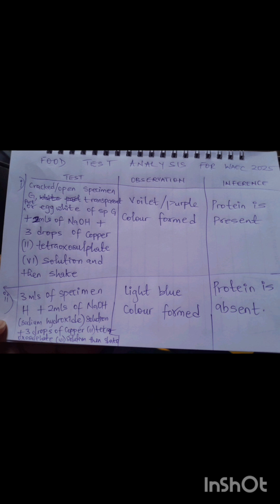But in this case they won't attach a needle, because a needle is just for piercing a vein. You need something tiny. You're not piercing anybody's vein, but you're trying to take samples of that liquid. So as you're pulling back the plunger of your syringe, you're collecting a liquid.